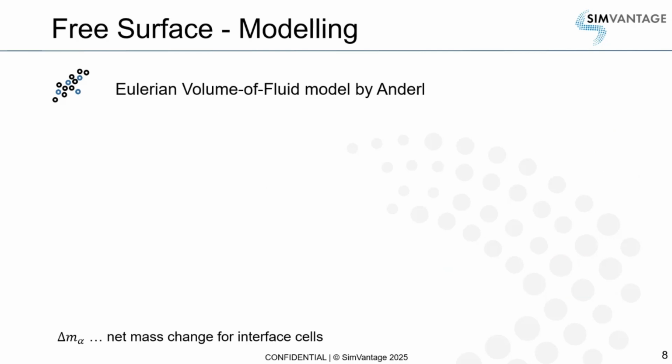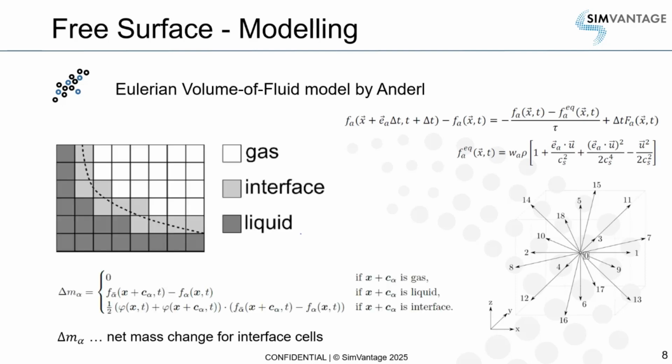Now, if you think about the surface of the reactor, oftentimes you have a vortex, which is sometimes responsible for foaming, but it gives you also an increased surface area, and this increased surface area can be used for headspace gassing, and therefore you want also to be able to simulate that. And for that we use a volume of fluid model where we distribute this interface between the gas and the liquid into gas nodes, liquid nodes and interface nodes.